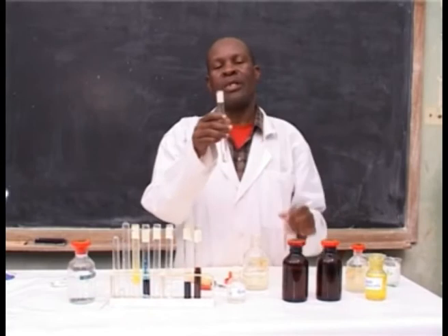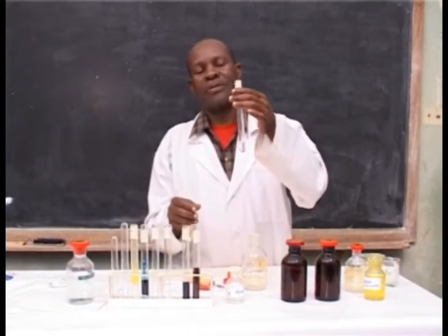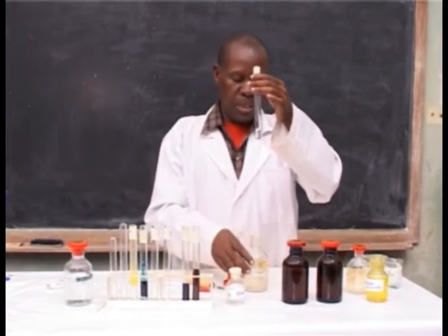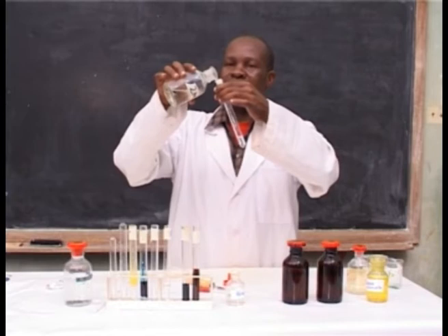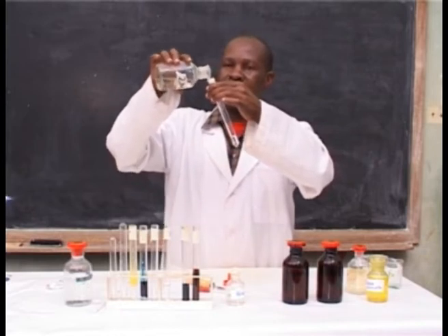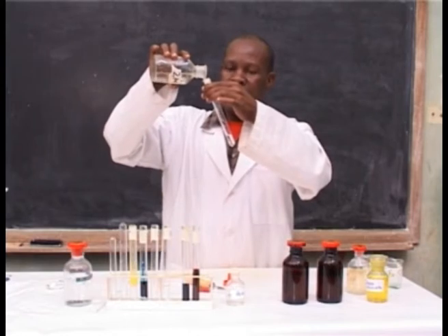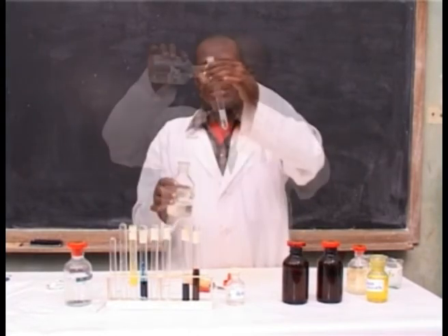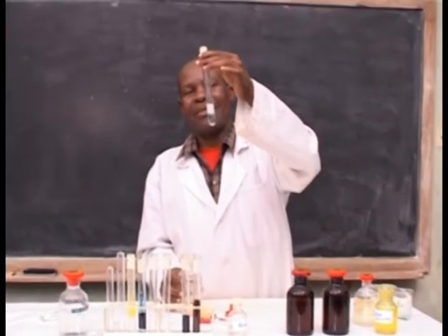To confirm a solution contains zinc(II) ion, you have to add sodium hydroxide solution. A white gelatinous precipitate is formed.